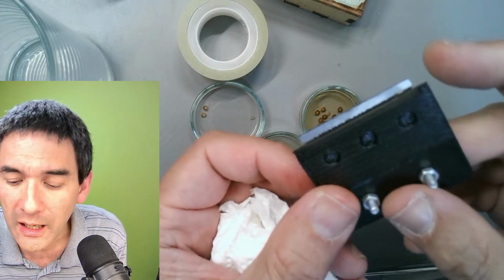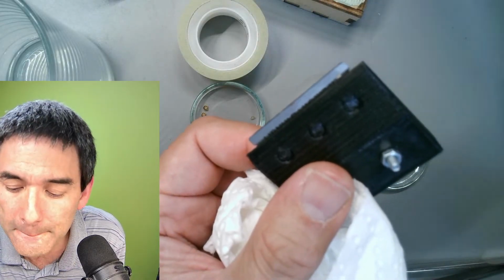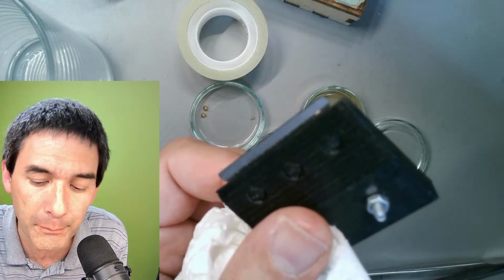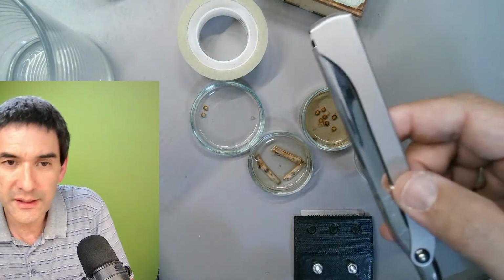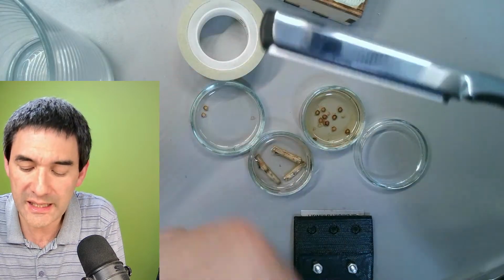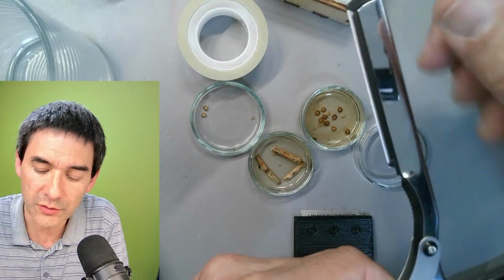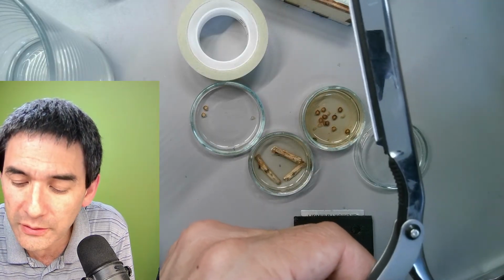However, there is another thing that I want to show you. Look at something else that I bought. This is also a razor blade, extremely sharp, but it has a disposable blade. And the advantage of this is that it also is very rigid, so it's not flexible, right? And I also want to show you one of those replaceable blades, how it looks like.